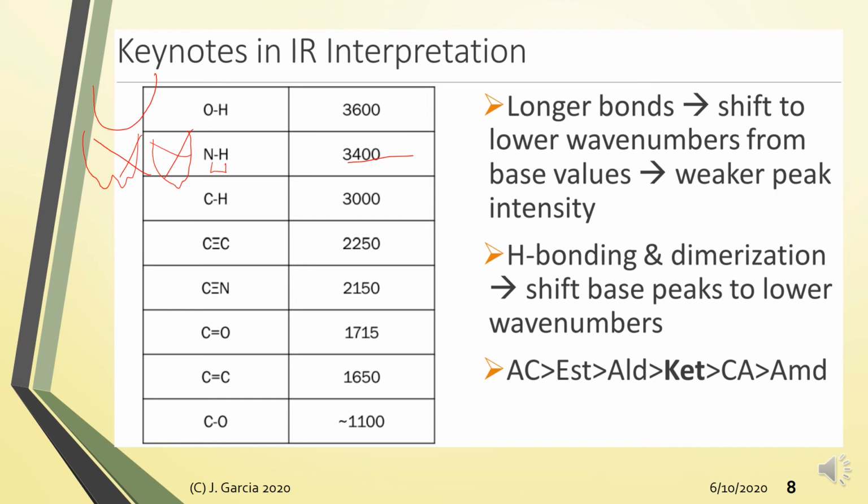And of course, you have your C-H bond. Okay, you have your C triple bond C and C triple bond N. Ito, madali lang ito, no?